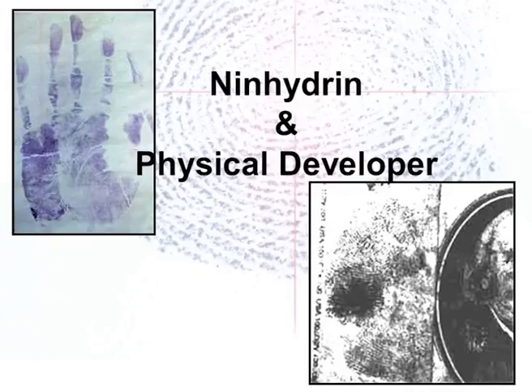Iodine fuming is one of the techniques which can develop fingerprints on human skin. The area of skin suspected to be impinged with latent print is treated with iodine vapors. Once the impression appears, these are pressed onto a silver plate. Exposure of the plate to light reveals permanent finger marks. If in a particular casework investigation, iodine method fails to detect fingerprints on crime scene evidence, other techniques like ninhydrin method may still be tried out.